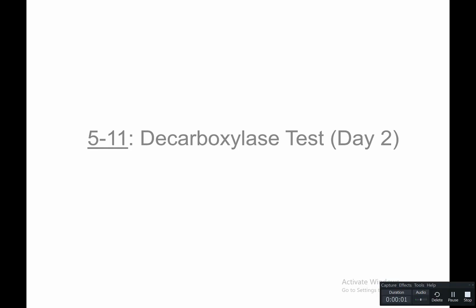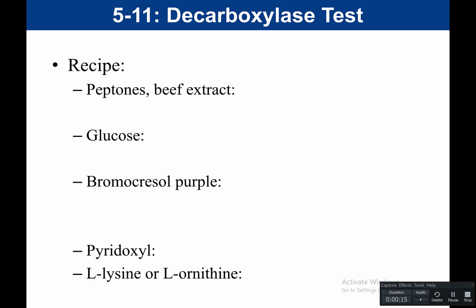Okay, so now we're going to talk about our decarboxylase test, day 2, how we would do our readout. And this readout is going to be done 48 hours after inoculation. So before we can do that, we need to talk about what is in the media. In this unit, we're starting to really focus on how bacteria metabolize proteins.